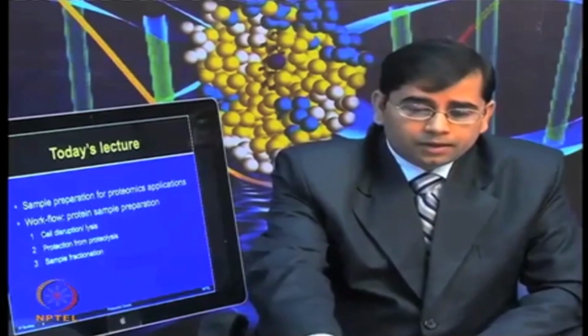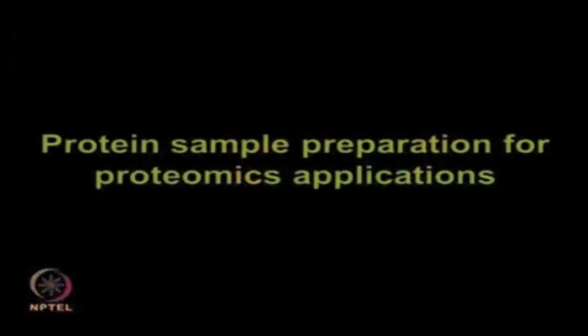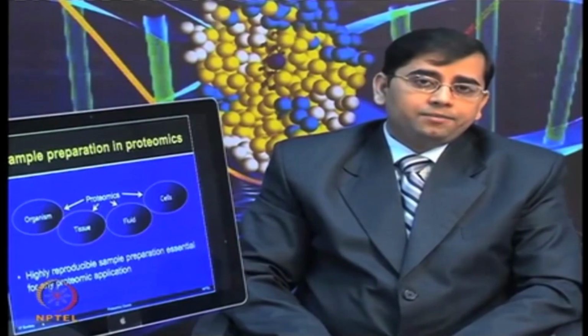So, let us start. Workflow for proteomic sample preparation. The proteome is very complex.